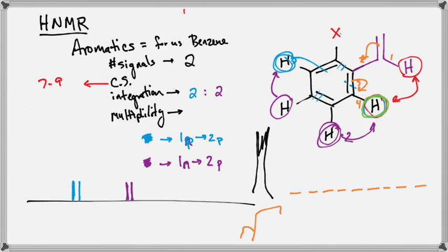And if they were neighbors to each other, guess what? That distance is going to match not just the signal you're looking at, but it's also going to match the hydrogen that caused the split. When we look at its signal, the distance between those peaks will match. That's called the J coupling. Right? You can get a lot of useful information out of that. There's questions in your SmartWork about that, but it requires you looking at a table of J coupling constants.